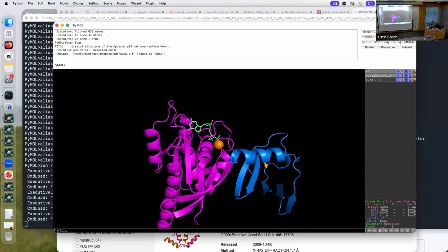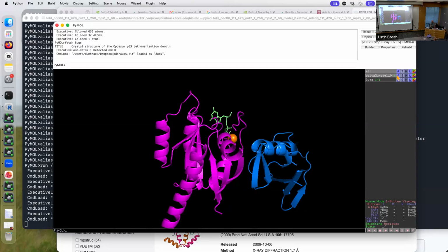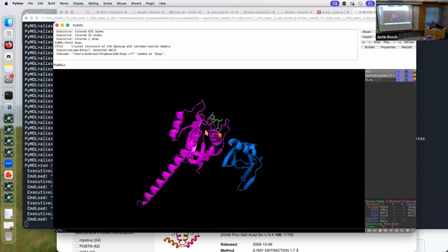I've already shown you RAF1 with the kinase domain and the CRD domain and the binding to KSR1. That was my IPSA example. This is just the RAS binding domain of RAF1. And it makes this sort of complex. The default when it opens is this kind of cartoon diagram. It's called cartoon by PyMOL. If you want to hide cartoon, you can hide cartoon.